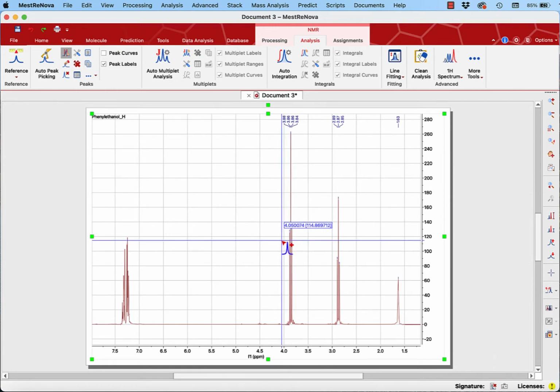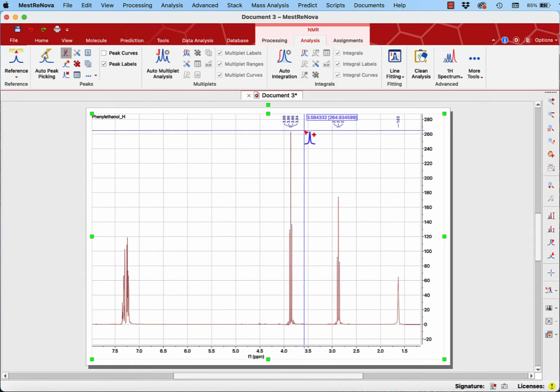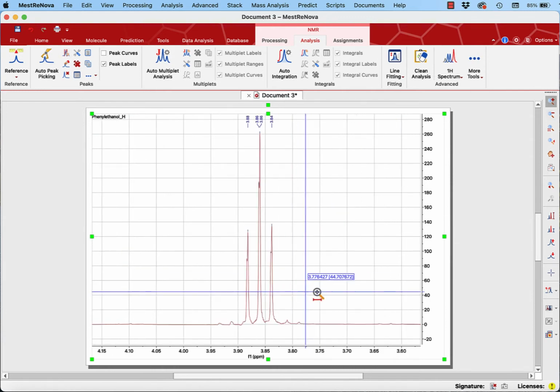But just notice how the peak picking is working. You mark anything above a certain line, which is why you don't go to the bottom with all this little junk stuff. And so this one is supposed to be a triplet, but there are actually 4 things that are marked. If that happens and you want to fix it, there's a way to do that. Why don't I first zoom in on that signal?